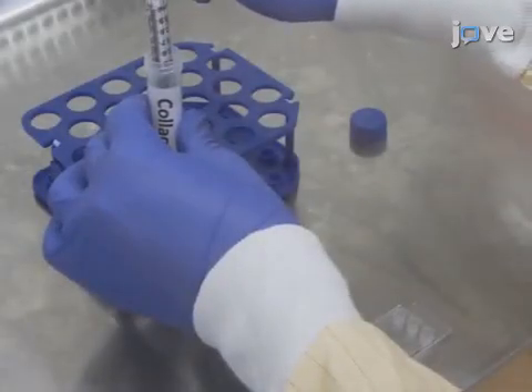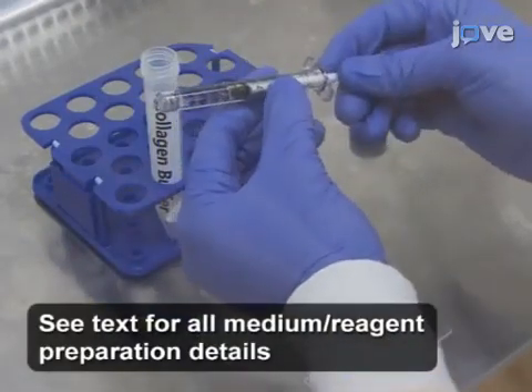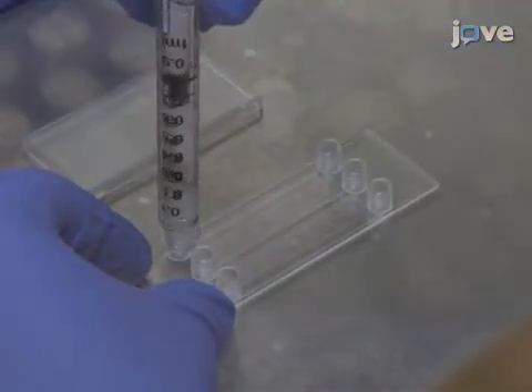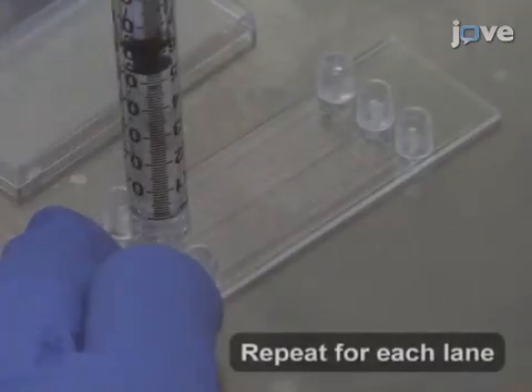Begin by loading 0.5 milliliters of collagen coating buffer into a 1 milliliter Luer-Lock syringe. Twist the end of the syringe onto the reservoir of a flow chamber slide and depress the plunger slowly until the entire lane is coated and each reservoir is full.